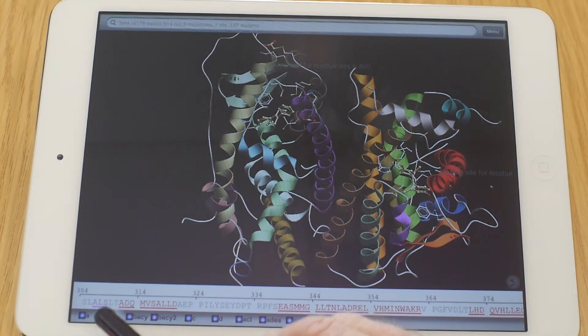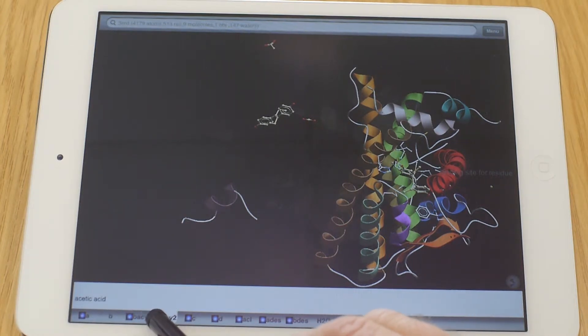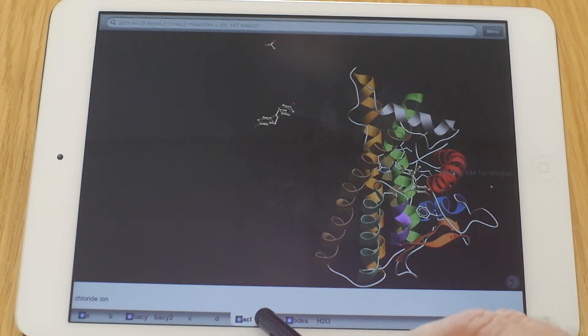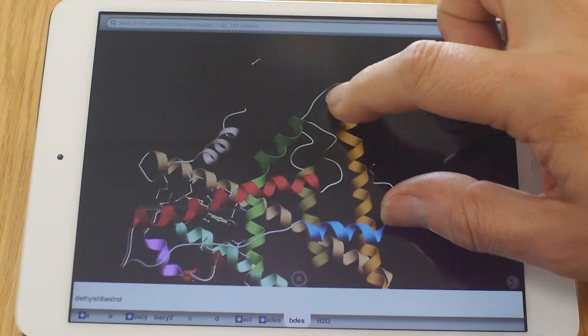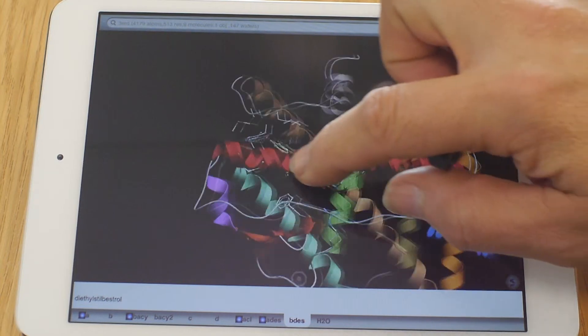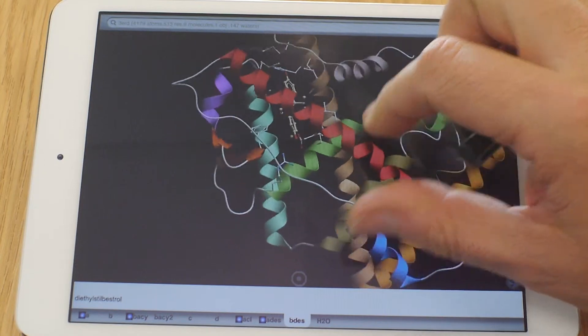Let's press away all the B buttons. For this you have to press them twice. Everything that starts with a B, we press twice. Let's get rid of C, D. Not this one. No, didn't want to get rid of this one. So now what you're left with is everything that has just to do with A, which is a single unit. So now you can see a single unit because in some files there's a single protein, single structural units, whereas in others you have two. And that can be confusing.